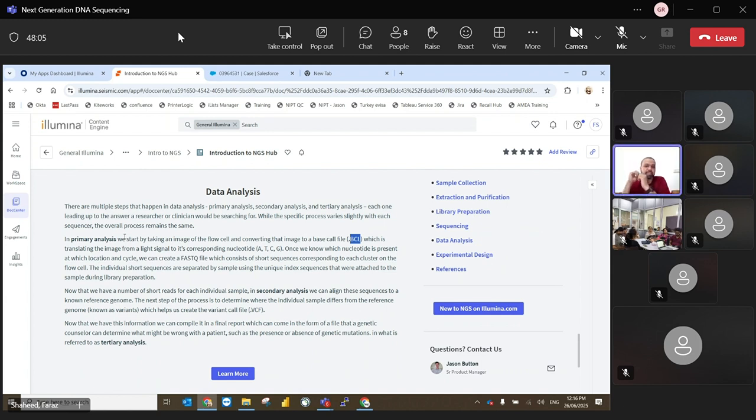So that is known as offset correction. You need to do the correction of the location of that cluster by doing those normalizations. So it is also a complex process, and you need a lot of bioinformatics support to convert that image into a base call file.